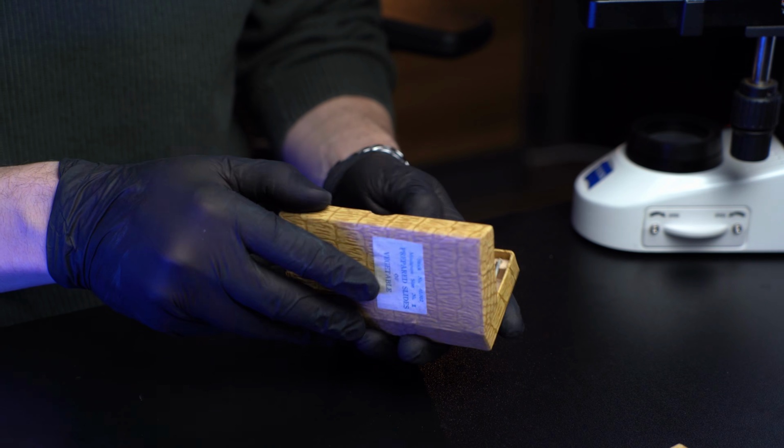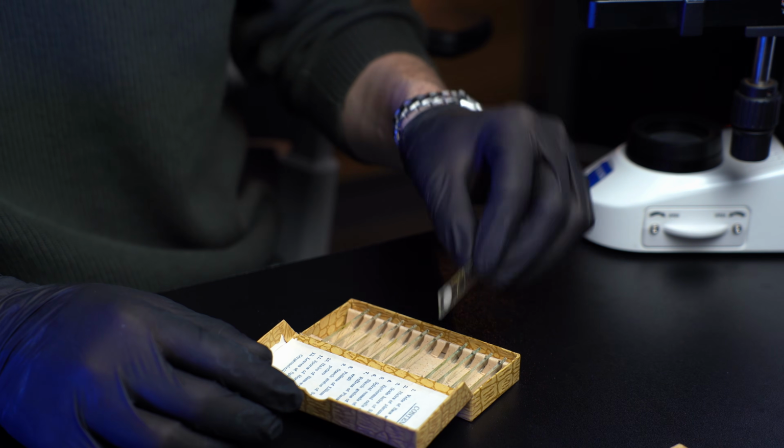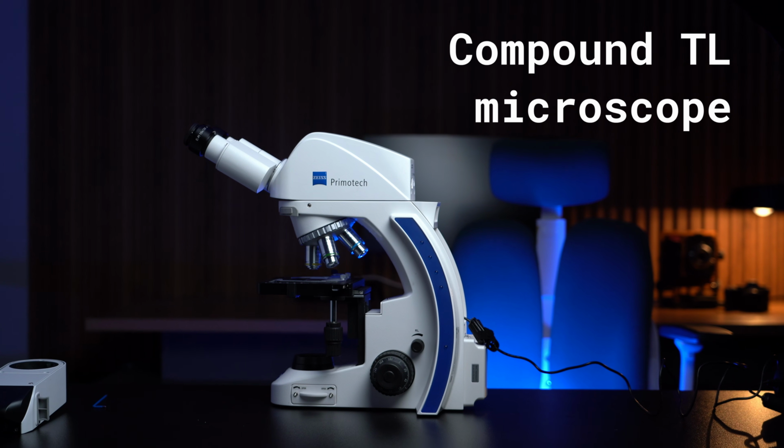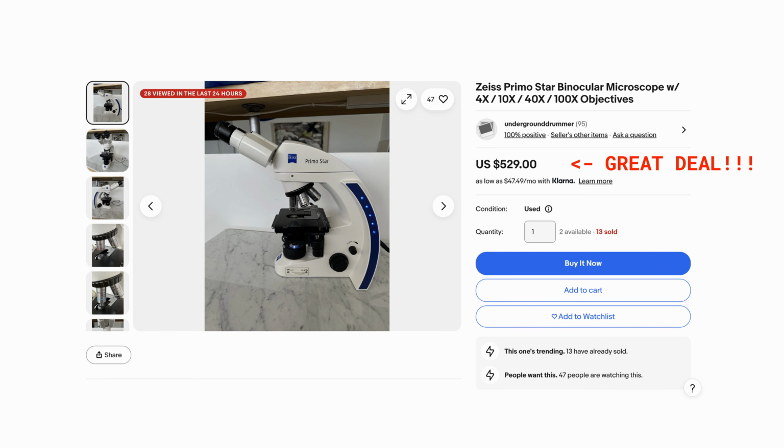Want higher magnification? Planning to study microorganisms, tardigrades, diatoms, or already have a collection of prepared slides? Then you should look at transmitted light laboratory called compound microscope. You'll get a beautiful image through the eyepieces and a very reasonable price. But as always, there are some pros and cons.